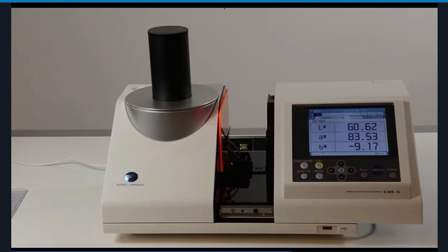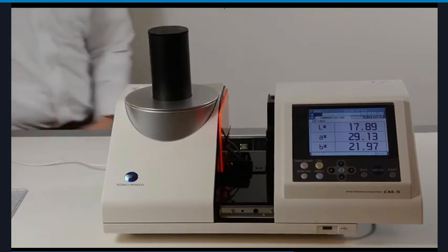Then we will receive the black backing pop-up window. Again, we have the ability to re-measure the reference black, but we'll click OK to measure over black. This concludes the haze measurement demonstration.